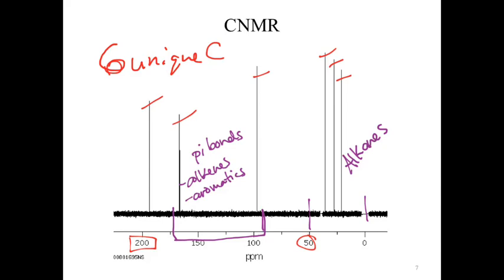The very last signal that we see is sitting right about 200. Very, very characteristic for a carbonyl. Kind of interesting. We've mentioned that that carbonyl was present already, but it gave us very odd characteristics in our IR. Okay, so that's all I would expect out of the carbon NMR. You'll notice that all of that information is included on there. It doesn't have to look neat, but the information needs to show up in some form or another.